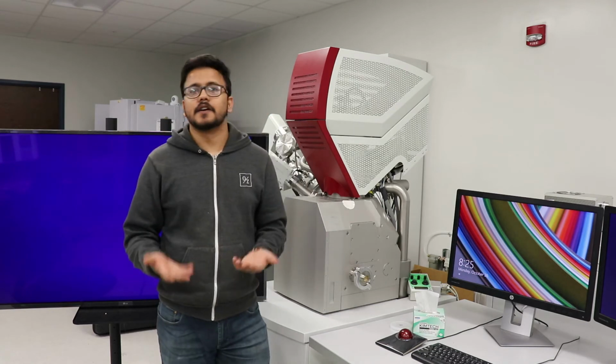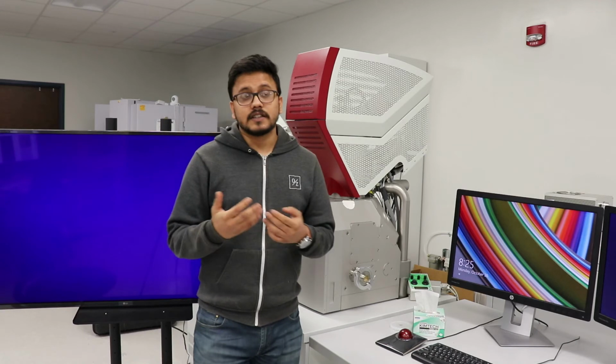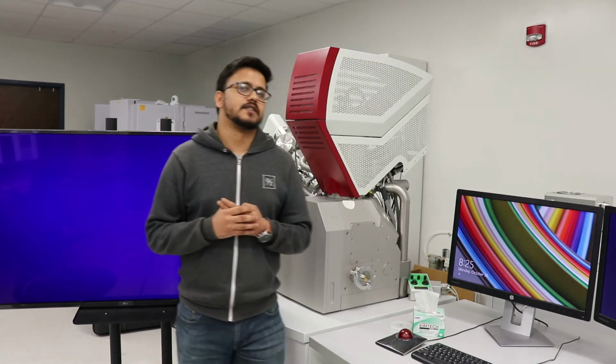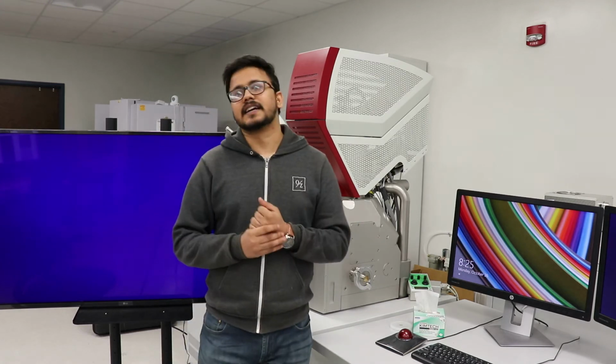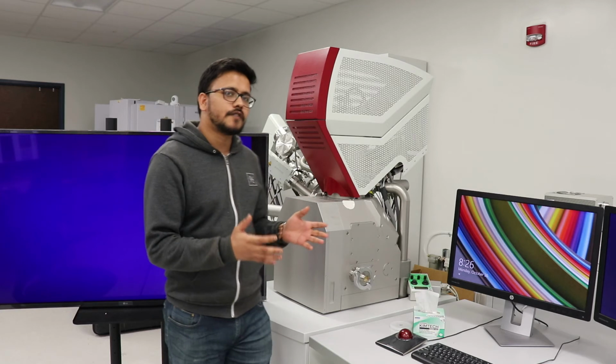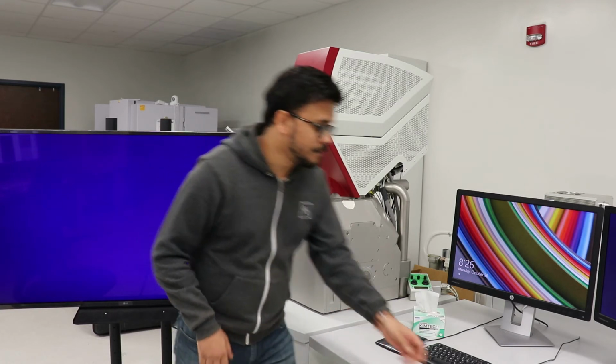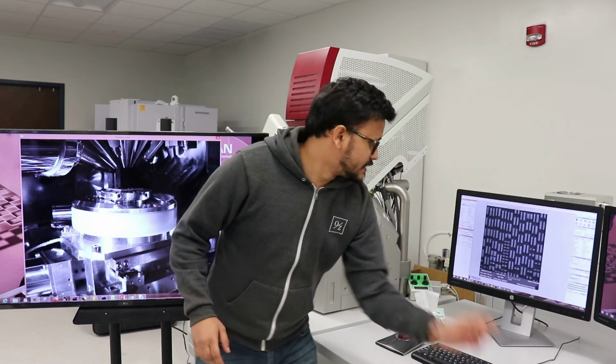Because we are surrounded by circuits from everywhere, from our watches all the way to spacecraft engines, that's the reason hardware physical inspection and hardware security is such a big and important thing in the present world. This is a combination of both the electron beam and the ion beam, which helps you understand it in a better way. So this is what this is about.